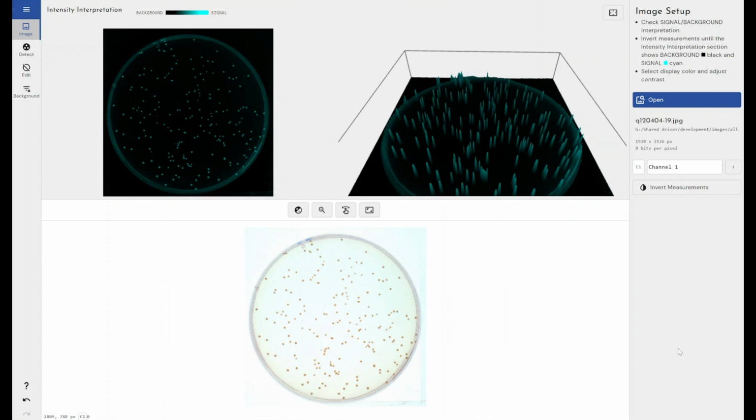So there are some manufacturers out there that provide automated colony counting and things like that to reduce the burden on people within the life sciences that perform this routinely. However, they typically are part of a larger system. So it's a piece of equipment that you have to buy. It's quite expensive. I don't know the exact price, but the idea is that it's all within the system. You buy the system, it's quite expensive, and you have to have that system within your lab.